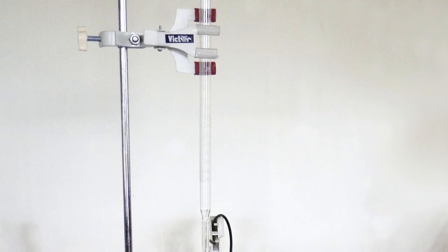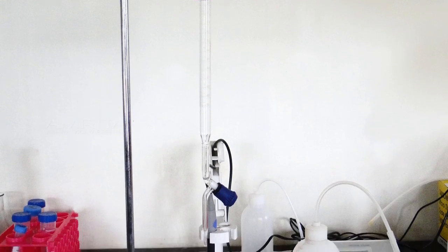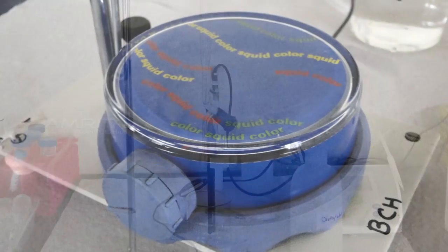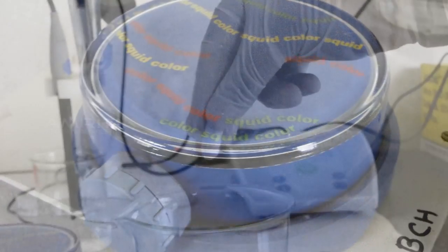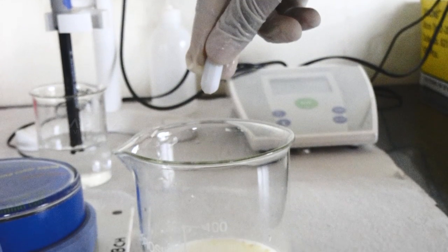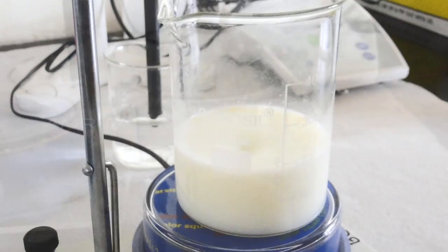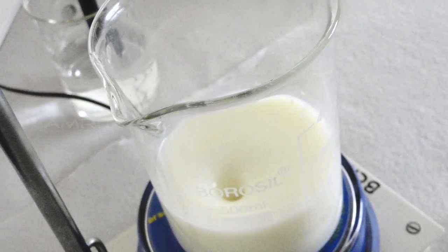Now take a 50 ml burette which will be used to add the HCl. Place a magnetic stirrer on the burette stand. Put a magnetic bar into the beaker containing the milk. Using the magnetic stirrer, stir well the contents of the beaker.